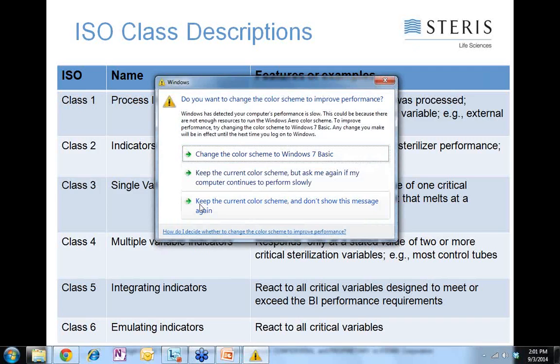But we think about steam contact and what we need to watch out for practically when it comes to making sure that we don't have areas that are going to prohibit steam contact. Of course, would be closed valves, tightened screw caps, or secured aluminum foil. I know sometimes it's very common to cover glassware in aluminum foil. Be careful, if you're rubber banding it, not to do that so tight.